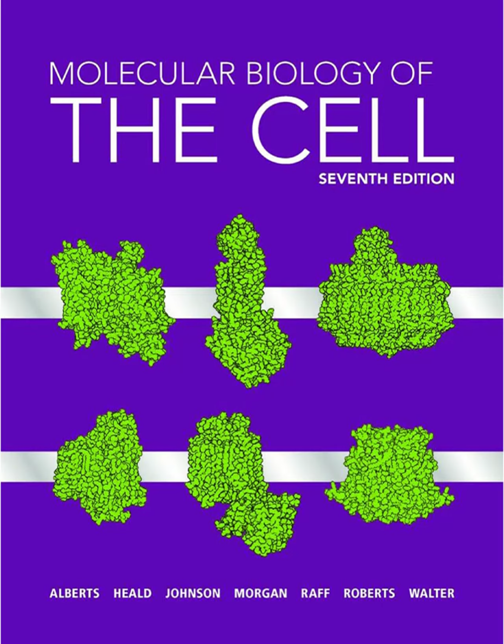Okay, that's manipulating the light or the molecules, but what about manipulating the sample itself? Expansion microscopy, ExM? That sounds wild. It's a totally different philosophy, and really clever. Instead of making the microscope better, you make the sample bigger. How on earth do you do that uniformly? You first fix and label your sample, just like for immunofluorescence. Then you embed it in a special kind of swellable polymer gel, like the stuff in baby diapers, but optimized. Critically, you chemically anchor your labels, or the molecules they're attached to, directly to the gel matrix.